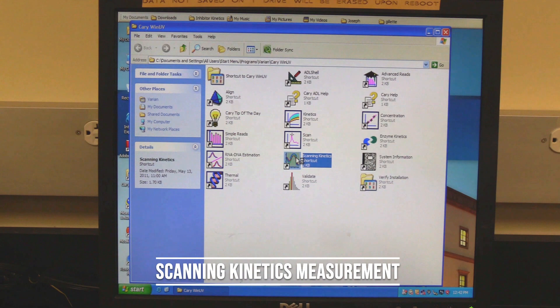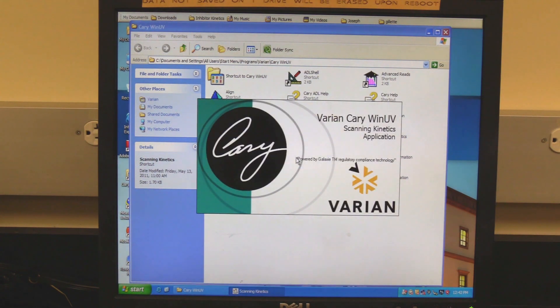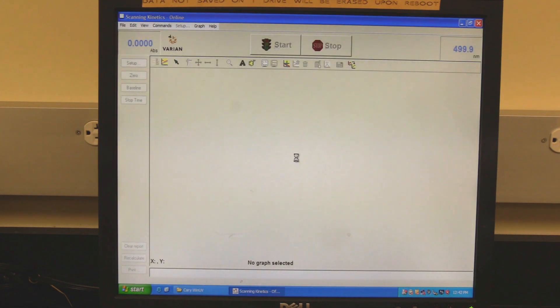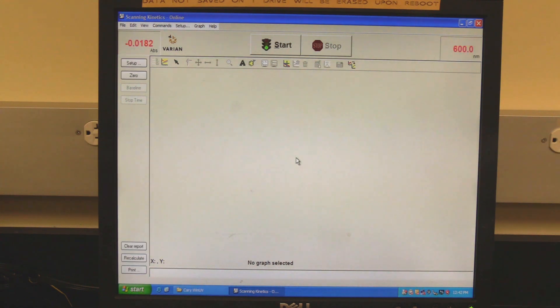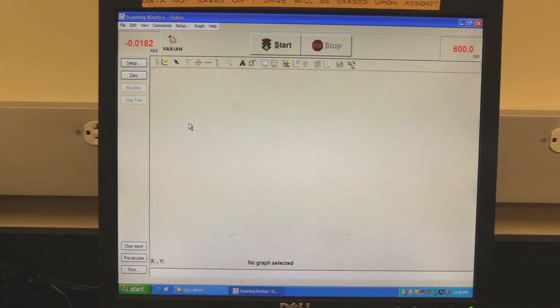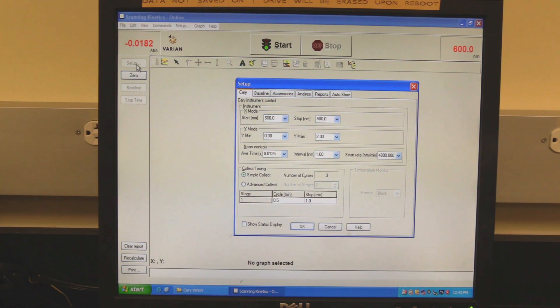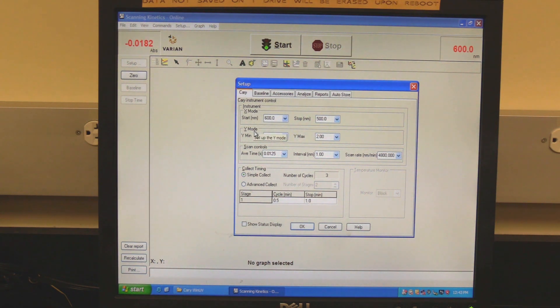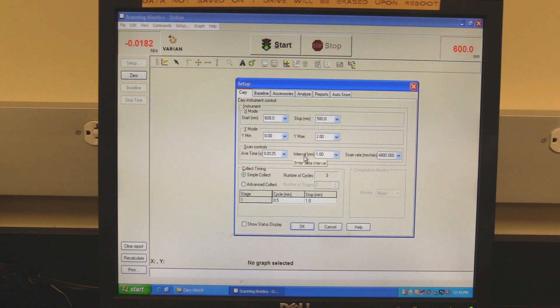Scanning kinetics measurement. In the Cary Win UV folder, double-click on the scanning kinetics icon. Wait for the software to open and initialize. The instrument will be finished initializing when the absorbance reading turns red. Click on setup to set measurement parameters. Setup should open to the Cary tab. In the X mode section, set the scan range. Start is the higher wavelength and stop is the lower wavelength. In scan control, set the scan speed by setting the average time and data interval. Scan rate will automatically be calculated.